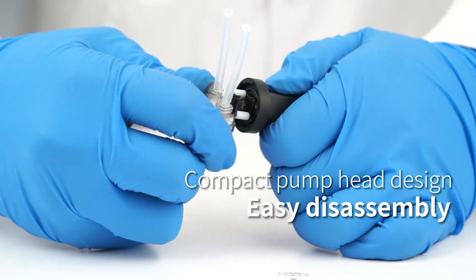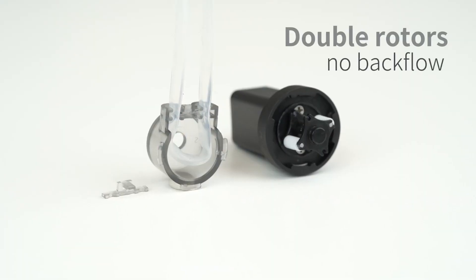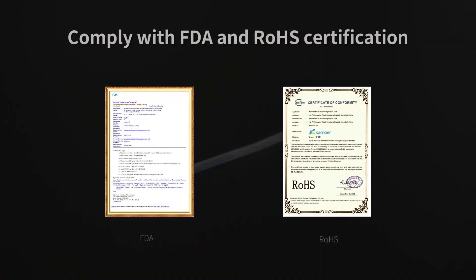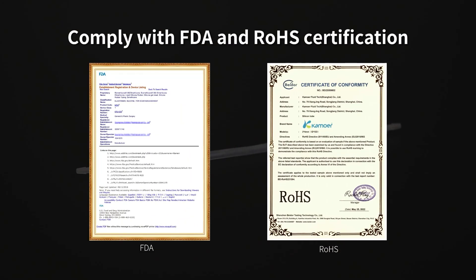The pump head is designed to be easy to disassemble, features double rotors and no backflow, is suitable for silicone tube, and complies with FDA and ROHS certification.